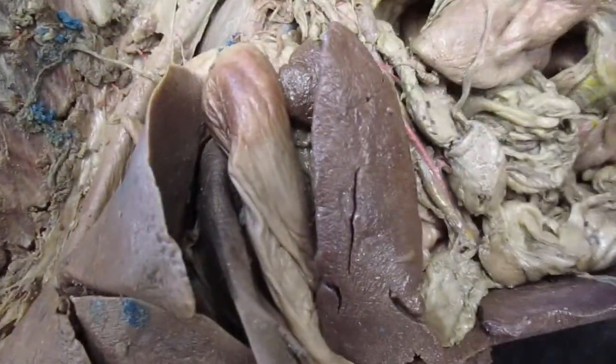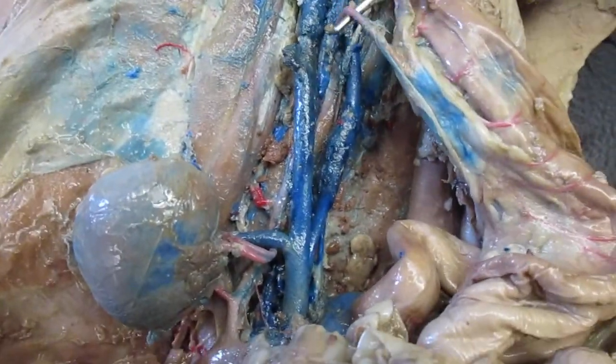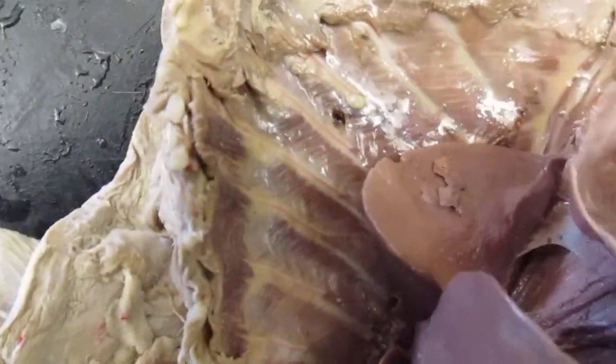sorry about this, having sort of a difficulty problem here. Let's go on to another one here. Here's one that's clear. So this would be your inferior mesenteric artery, and this shows it pretty good. We'll just show this again.